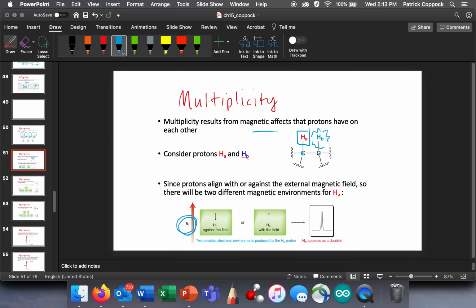All right, so you can see what the neighbors are, but you're going to be tempted sometimes to see another hydrogen which is close by. It's not technically the neighbor because it's not close enough. So we've got to get used to this. It's 1, 2, 3, 4. 1, 2, 3, 4. There's the neighbor right there.